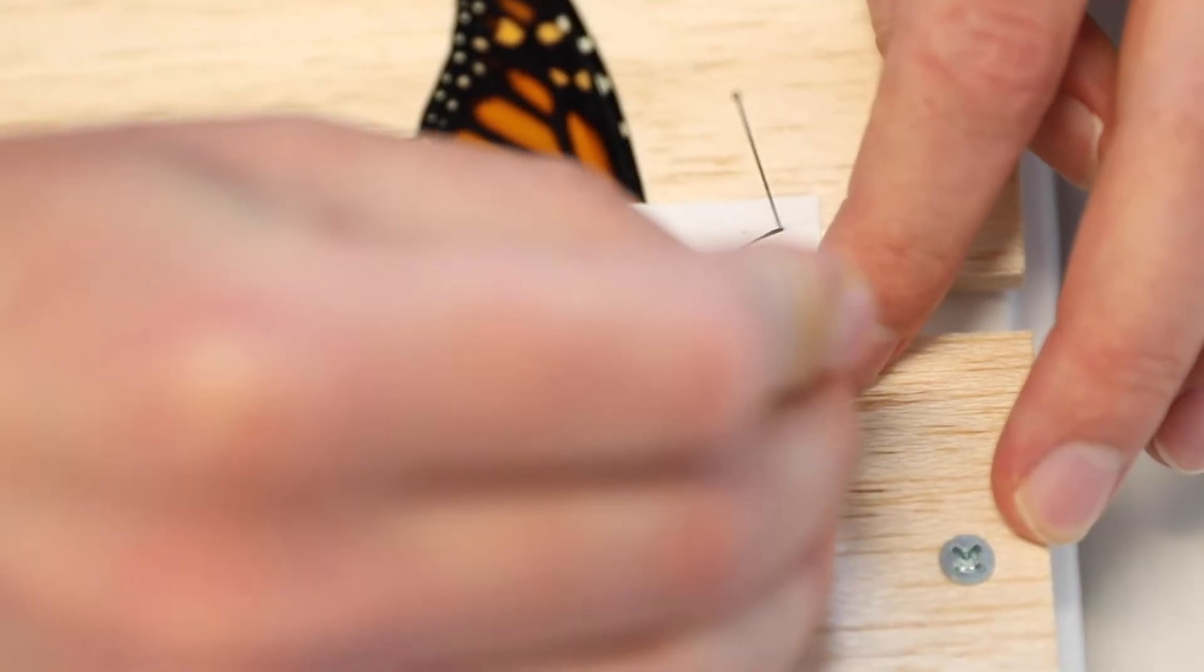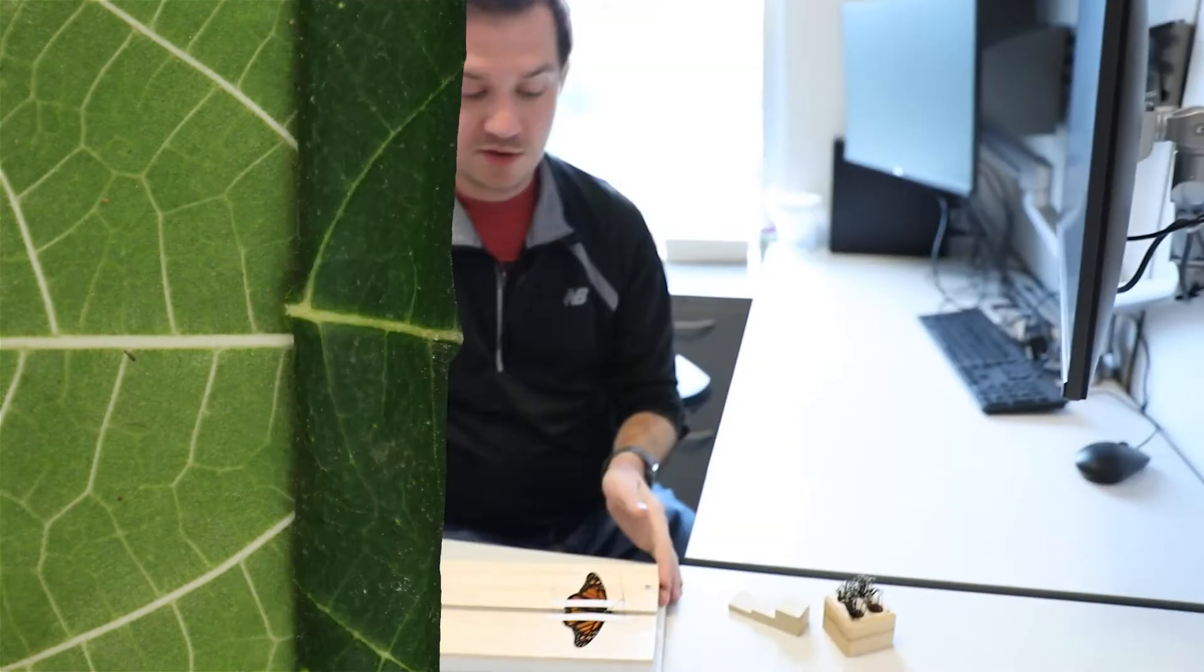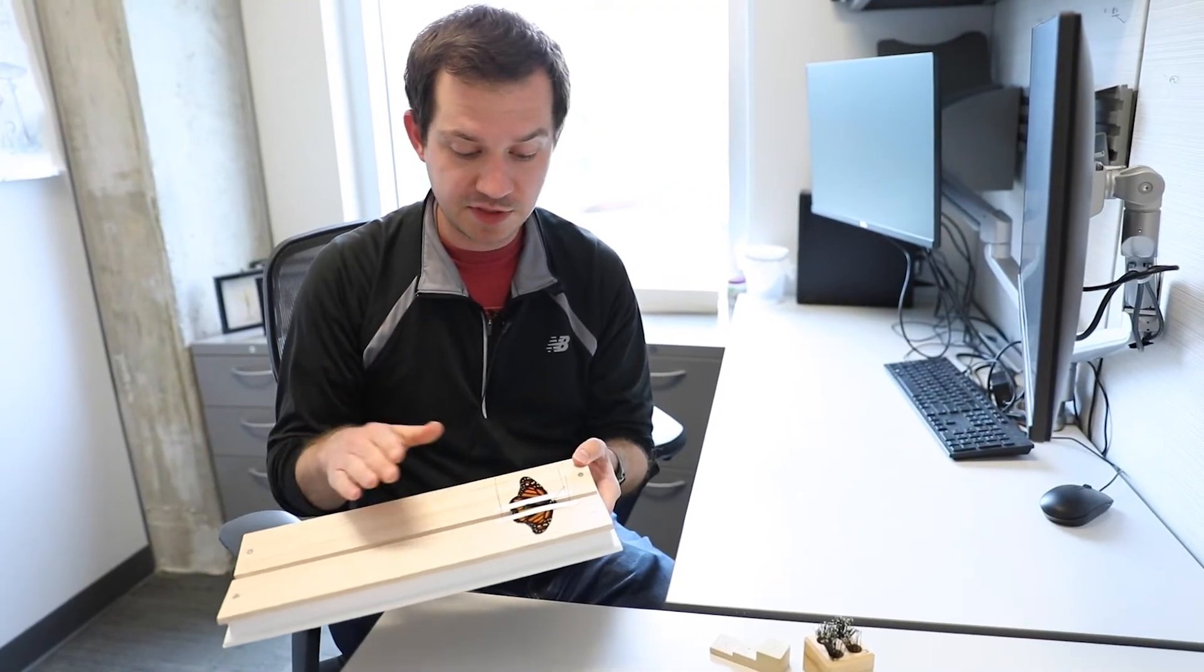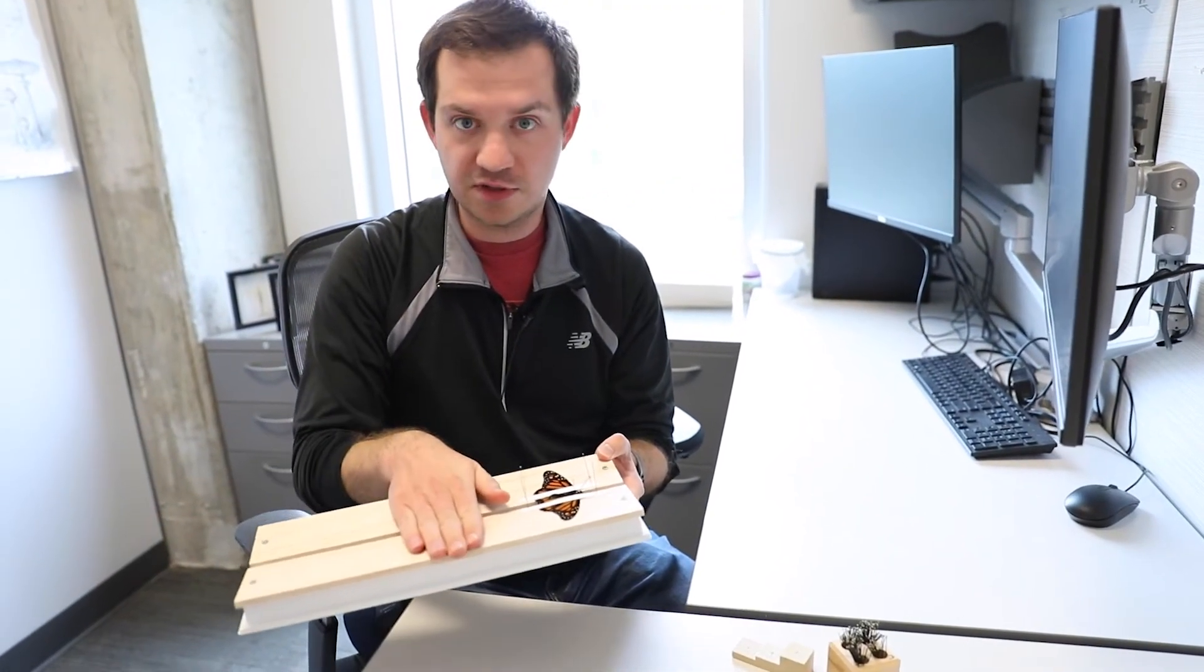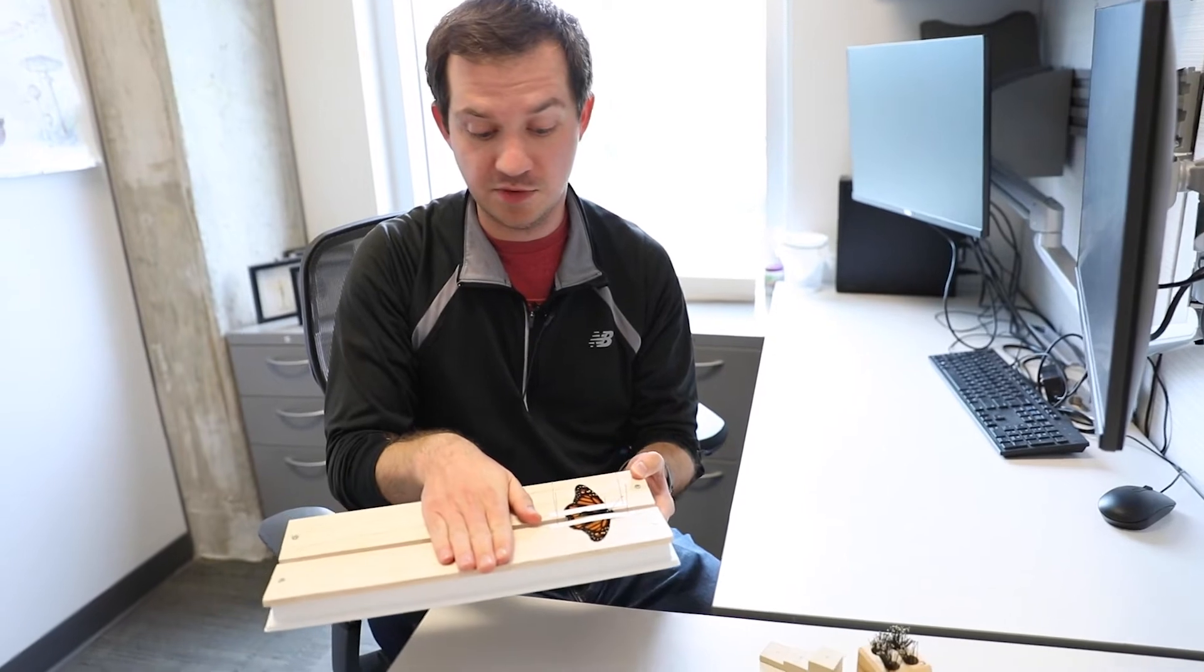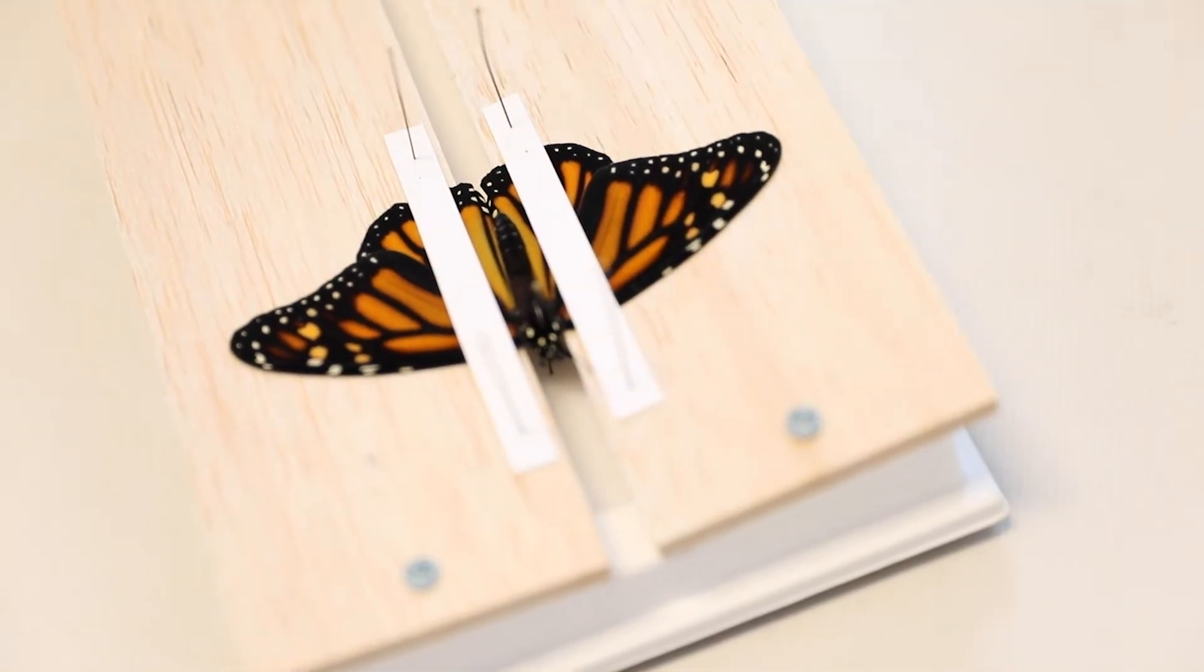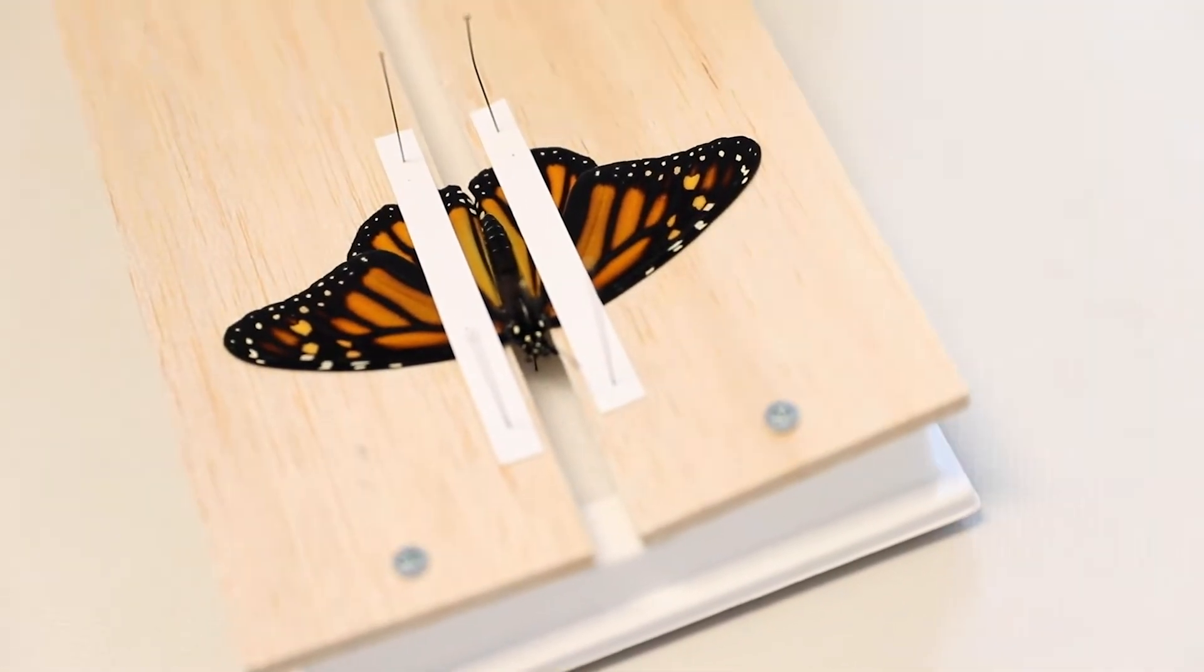I like to do the same exact thing to the other side. I'll take that piece of paper, take a pin, and just seal it in like that. Now our butterfly is on our spreading board, we have the pin at a decent depth, we have the wings perfectly flush with the top of the spreading board.